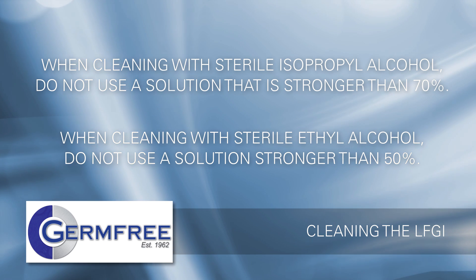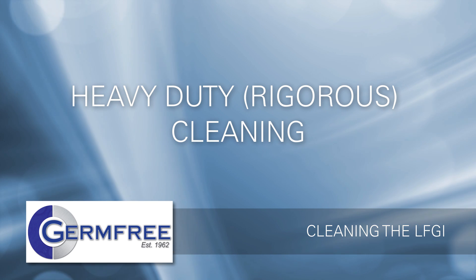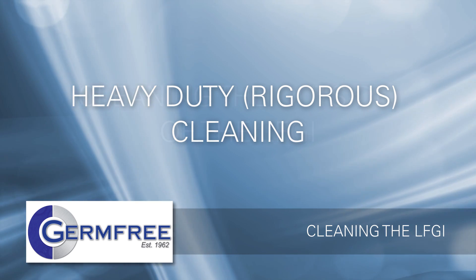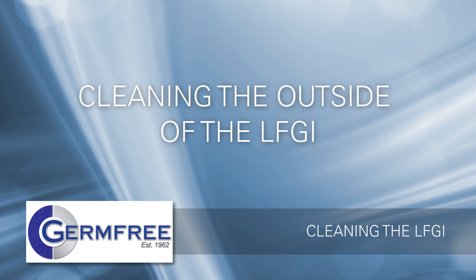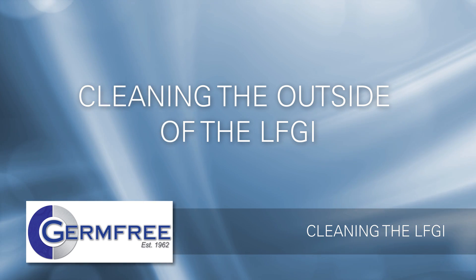You are now ready to begin your heavy-duty or rigorous cleaning of the LFGI. The outside of the LFGI can be cleaned at any time. If the unit remains closed, no additional PPE is needed.